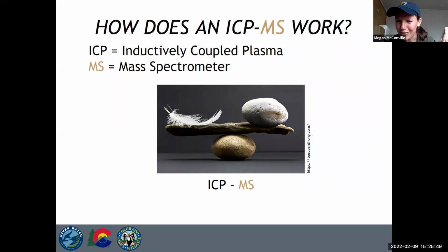These little parts of the feather. You guys are thinking about it. Okay, you snip off a few parts of that, right? And you get a slightly different mass. And accurately, I can measure that rock simultaneously to that feather, or a few snips off of that feather, or just the tiny, tiny ones, right? And these represent obviously much smaller masses than this image can relay.